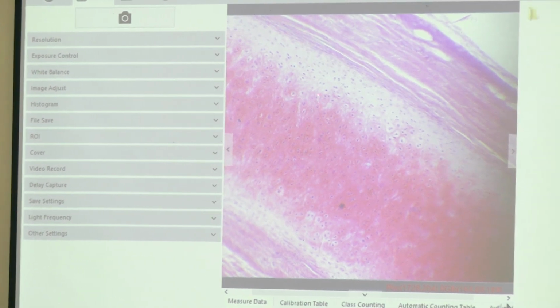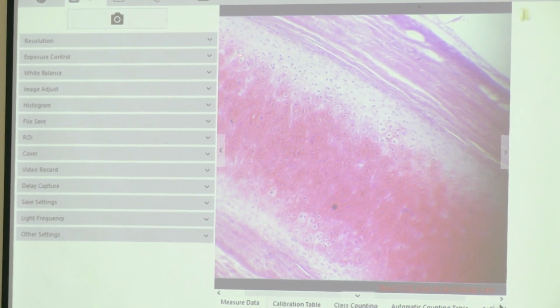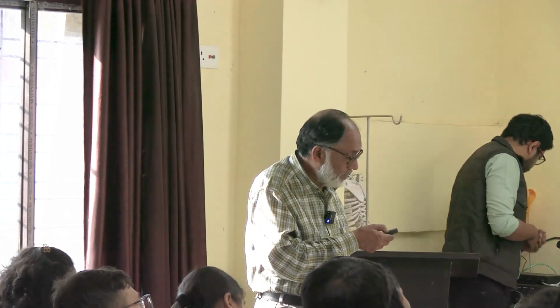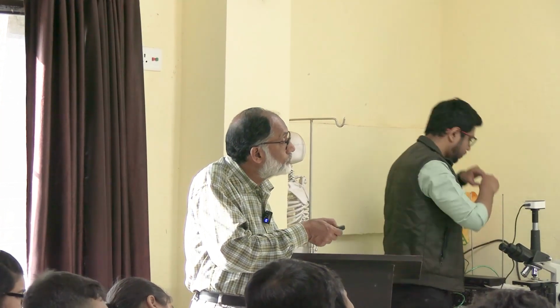There is no maximum group of 2 or single, a group of 2, right? So, in case of hyaline cartilage, you will get cell nests, but the population of cells is either 1 or 2. Right? Here you see at the periphery there is a capsule. This is the capsule.